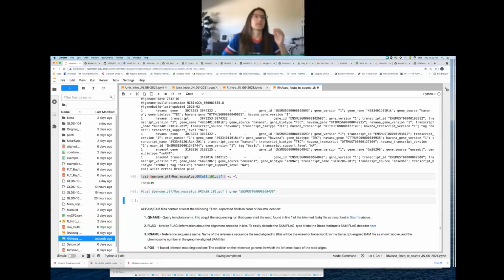Just to clarify, we changed from head to wc count and then to line count to better access the data. Can you say we modified that code? This was all different ways of looking at the same file, and so we were looking at different aspects of the file.